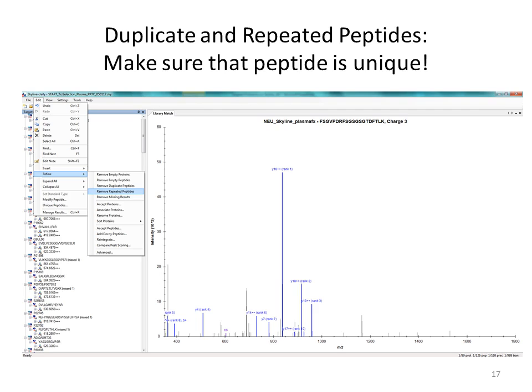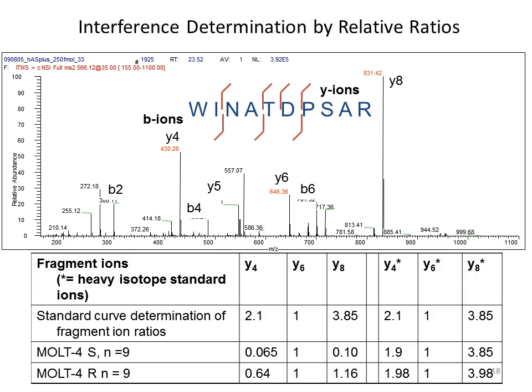So it's a tricky thing, but depending on the quality of data that was generated in the spectral library, the list that you have, how it was generated, who gave it to you, how well you trust them, this is always an important thing to do. Because if you have the same peptide coming from different proteins on your list, how do you know which protein that peptide came from? There's no way. So why monitor for it at all? Kick it out. Or if it is very important to a particular family of proteins and you're monitoring other peptides from that family, you may want to keep one version of it. But this is just one way to help refine your list and decrease the number of targets.